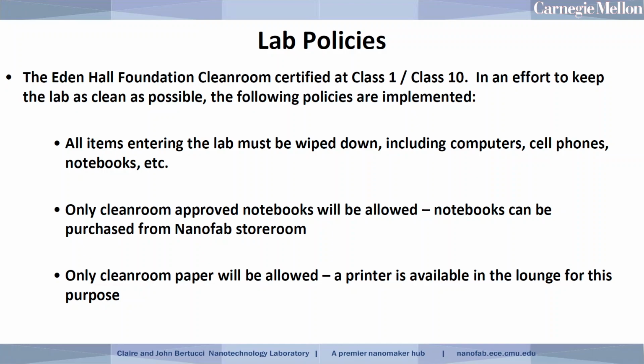So what that told us was that throughout the entire construction, we did a good job mitigating particles, cleaning surfaces as we went, as the lab was built. So that's great, but we want to try and keep it as clean as possible for as long as possible to help us reduce some of the maintenance and cleaning that we have to do periodically. So we have some rules in place to that effect.